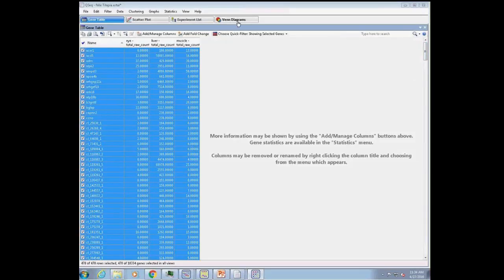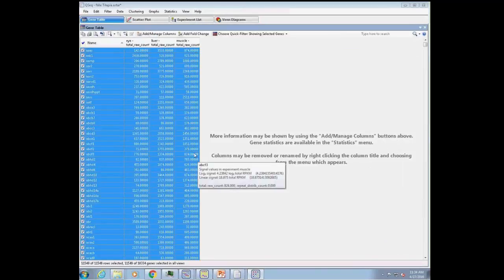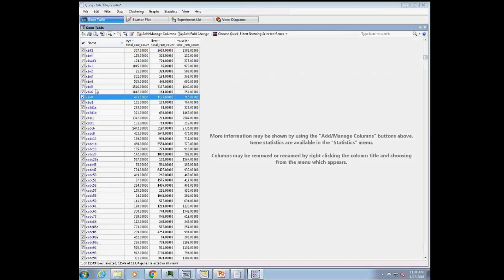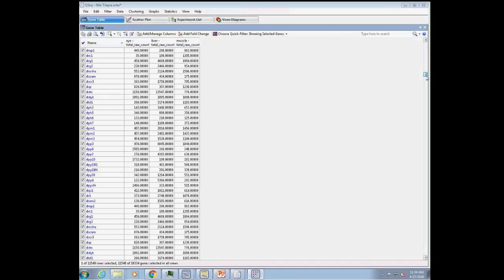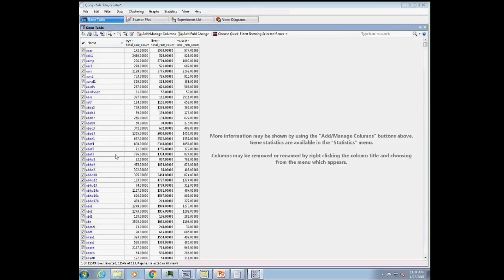And if I go back to the Venn diagram and look at the intersection, I'll go back to this, it will just bring more in. So now we have the larger set of mRNAs that are expressed across the different tissue types. And now we can see we got quite a few gene names. So what's nice is we got a lot of different gene names here. A lot of annotations came through. And I'm just going to scroll down so you just get an idea. Out of the 11,549, we've got all these different gene names.